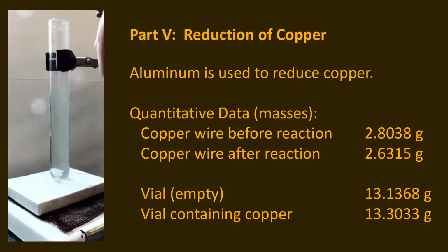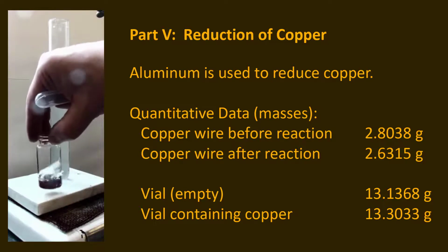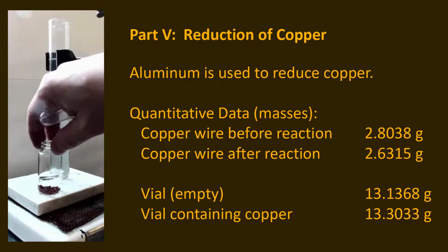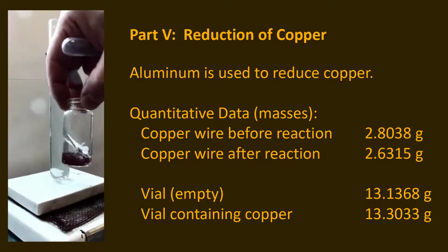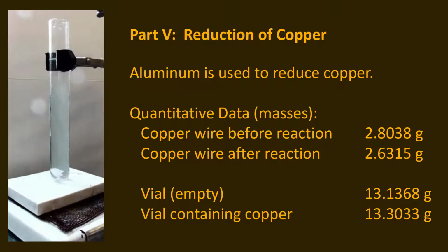The idea here is that methanol and water are completely miscible, so the methanol will dissolve the water, break up its surface tension, and help it be more volatile.